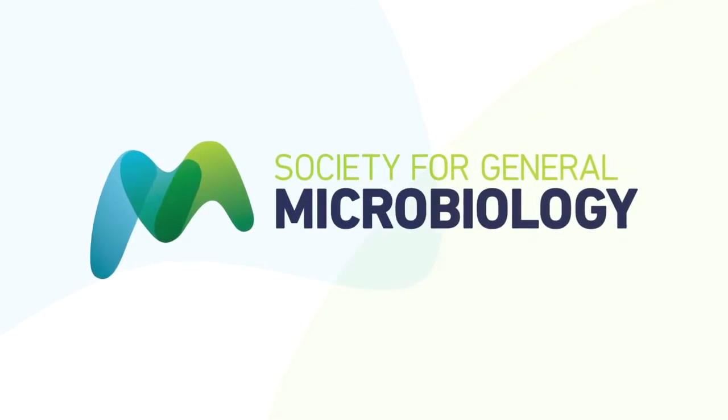Those can now go for autoclaving. Great, thank you.